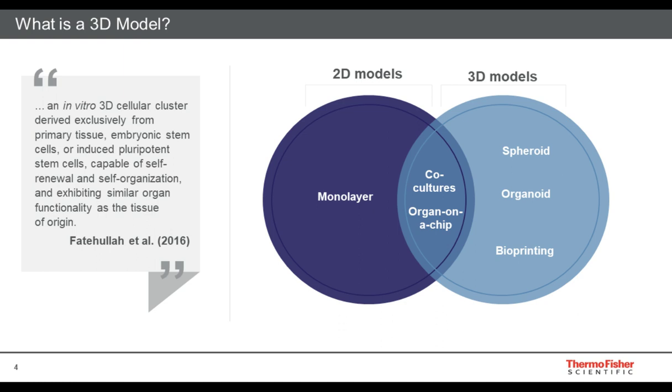And for today's talk, the emphasis of the information that I'm going to give, although it's not limited to spheroids and organoids, will be those as the 3D models of focus. So for most of what I'm talking about, and I'll refer to them as we go, usually I'm going to be talking about spheroids and organoids as a 3D model.